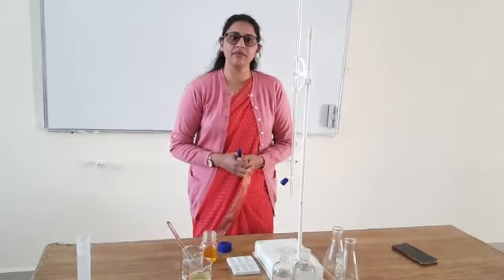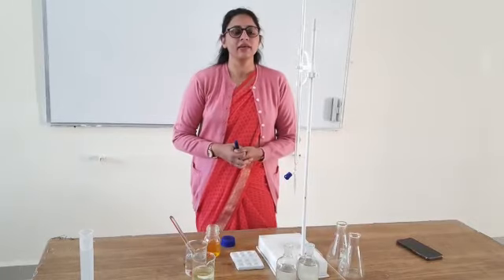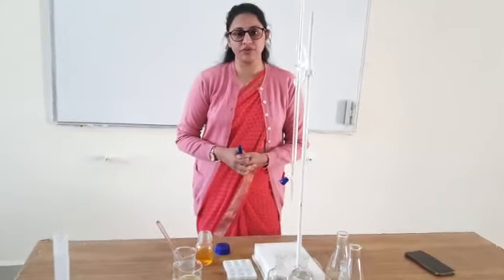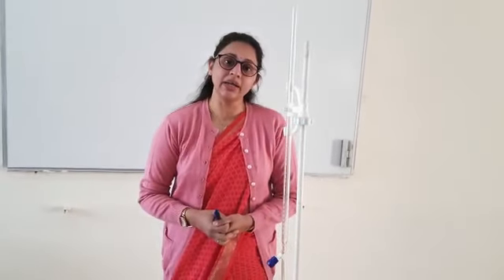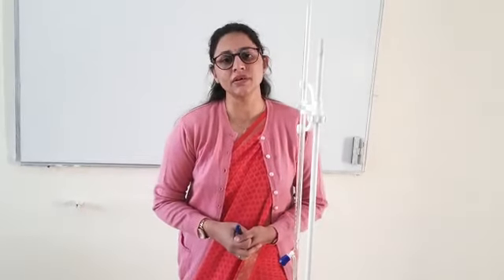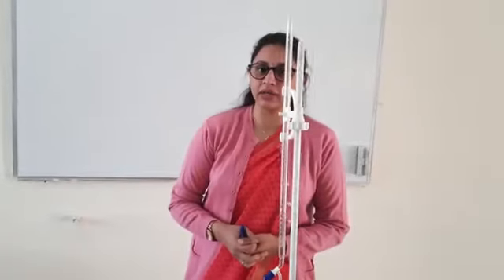My name is Dr. Grandjali Bisht and today we will perform volumetric analysis, where we will determine the strength of an unknown ferrous ammonium sulfate solution by titrating it with a known potassium dichromate solution using an external indicator. The external indicator we will use in this practical is potassium ferricyanide.